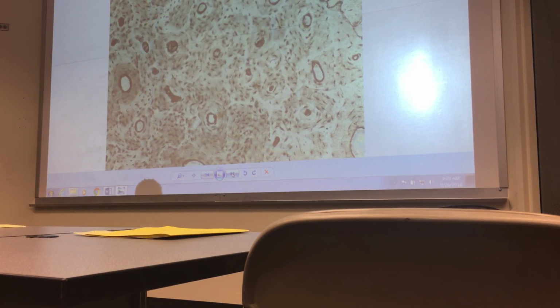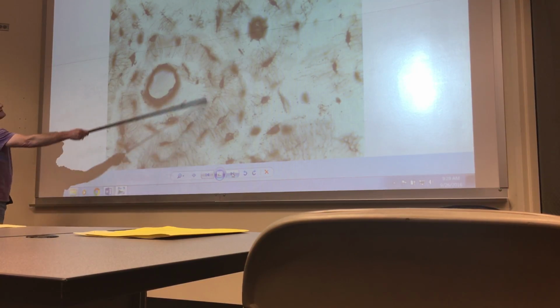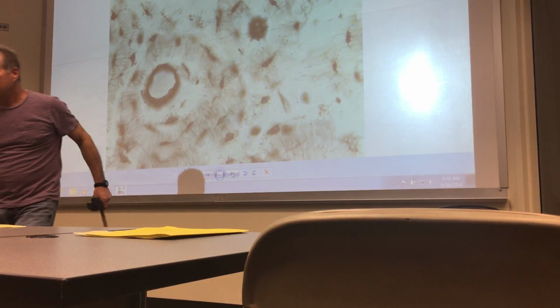Then, of course, you have bone. Bone is a freebie. Looks kind of like trees that were cut down, and your mom or your dad talking to you about counting the rings to know how old the tree is. And I don't know if there's any truth to that or not, but while it's not difficult, there's a lot of verbiage that goes with this, and it's all spoon-fed to you on the DVD and in the supplement, so there's not really any need to rehash it in here, but in a nutshell, each one of these things, so that's one, there's another one, there's another one.